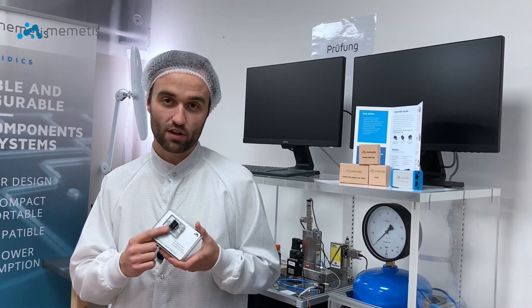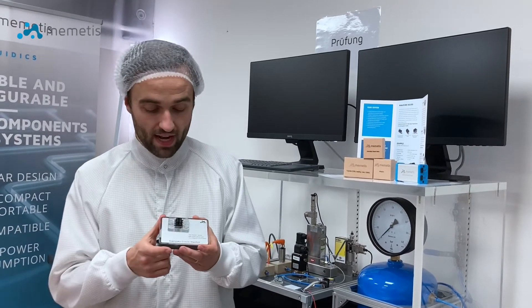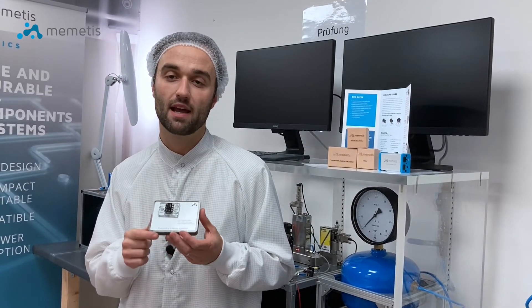A special alloy also ensures reliable operation for millions of switching cycles. Thanks to the media separation and biocompatibility of the materials, our valves are particularly suitable for applications in the life sciences.